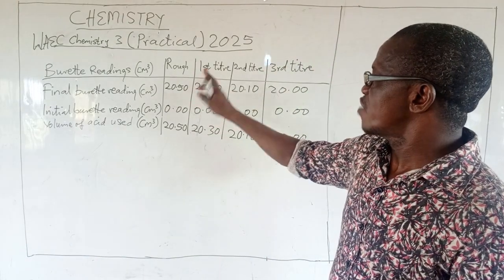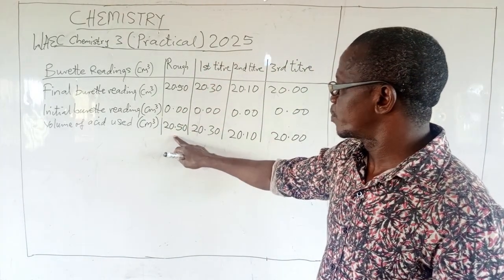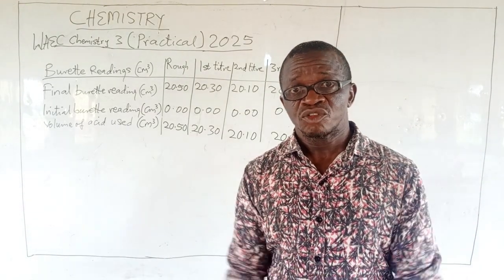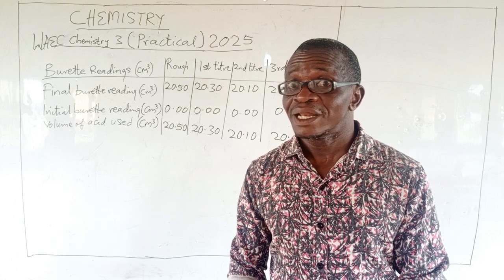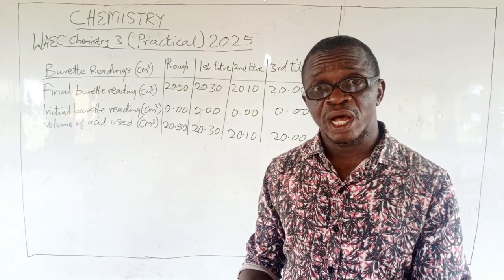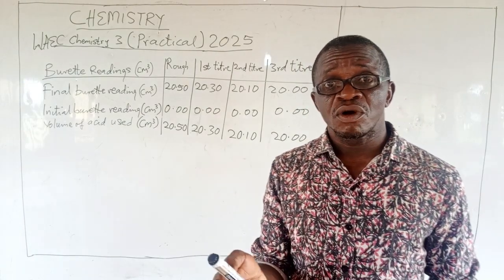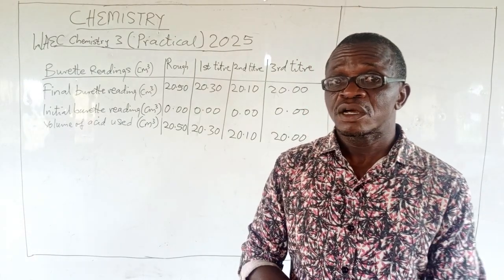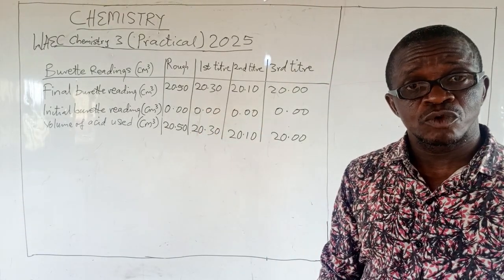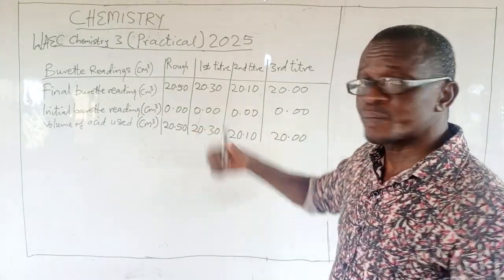Okay, so having done that, I have subtracted, I got this. And I emptied everything, rinsed them with water. Never rinse the conical flask that you are titrating with, never rinse it with base or acid, apart from distilled water. So rinse the conical flask with distilled water. Soak the base again with your pipette.